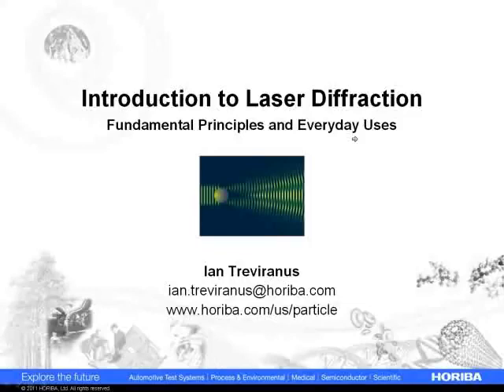We're not going to go into anything too deeply. It should be very informative, not very commercial, I hope. And we're going to cover everything from fundamental principles all the way up to practical everyday uses, how you can maybe get a little bit more out of your analyzer.